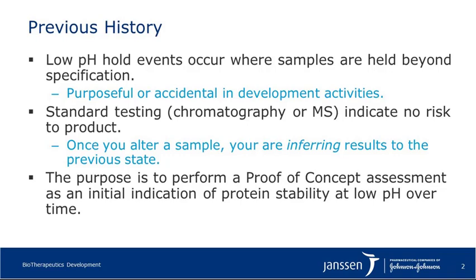These non-conformances can be purposeful or accidental, as part of development activities. And we deploy standard testing, typically chromatography or mass spec, and over again, there was no indication of risk to the product. We did have a separate technique which allowed us to look across the number of batches involved in those nonconformants and actually see differences across those.